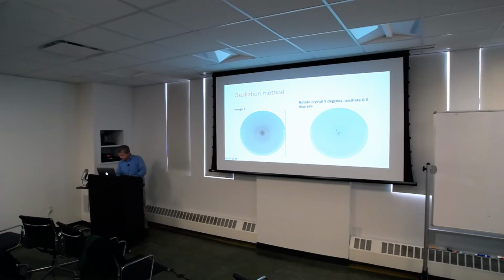Everything has moved a little bit, and because you've rotated it, you start to see these first order diffraction spots which were invisible from this particular view. Also, because of the oscillation, you fill in a little bit. These are the lunes in here, and the other things have shown up out here. Again, this is what's done in X-ray crystallography.